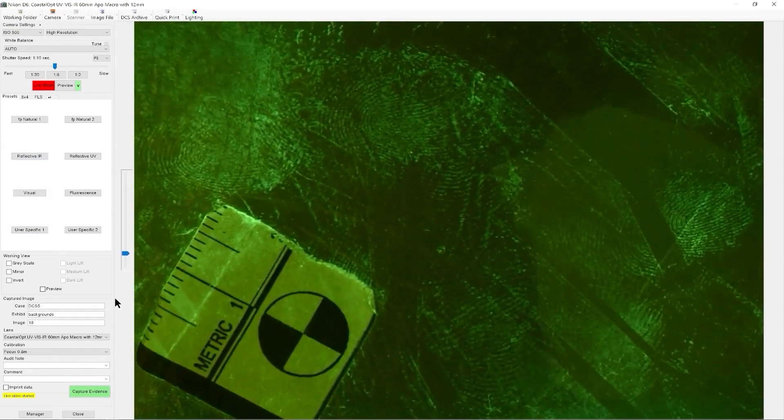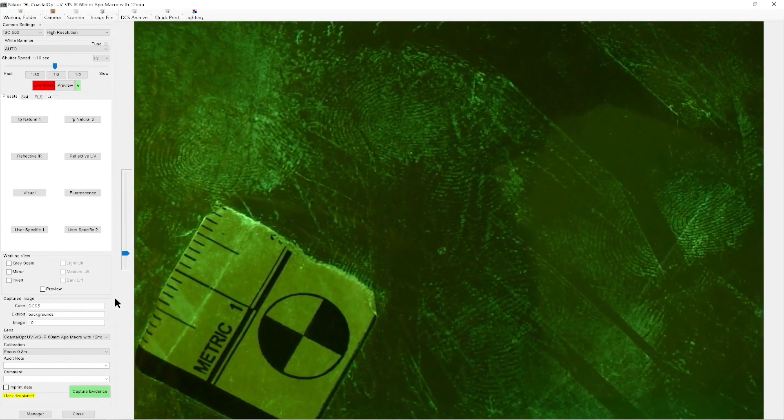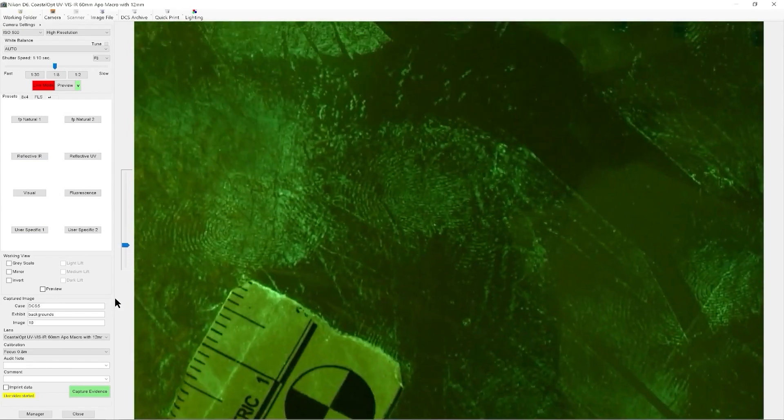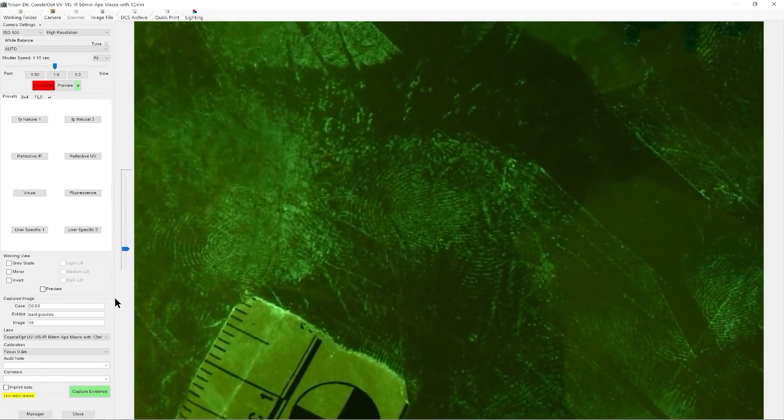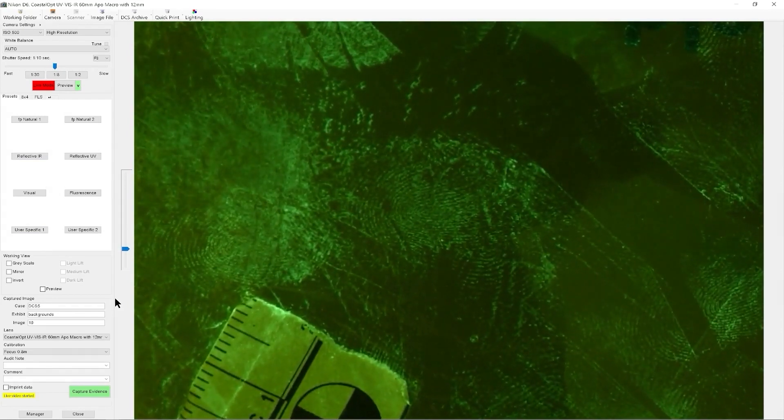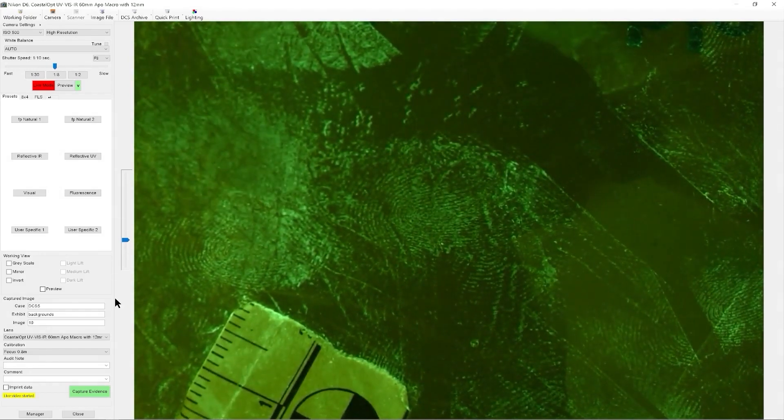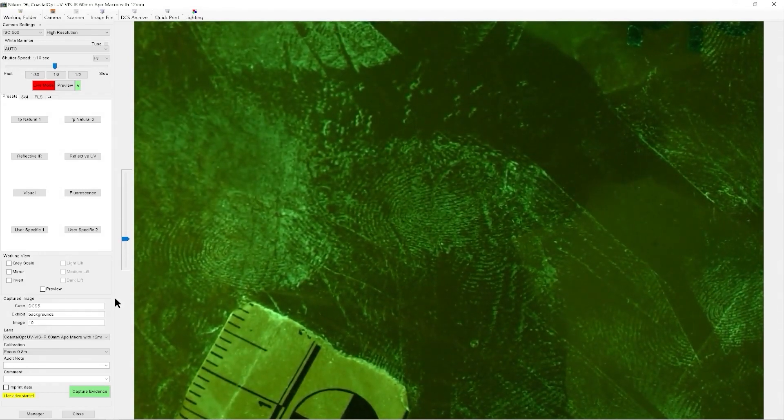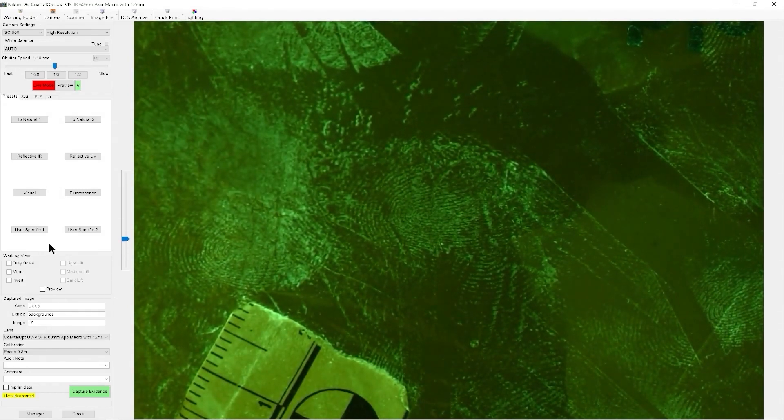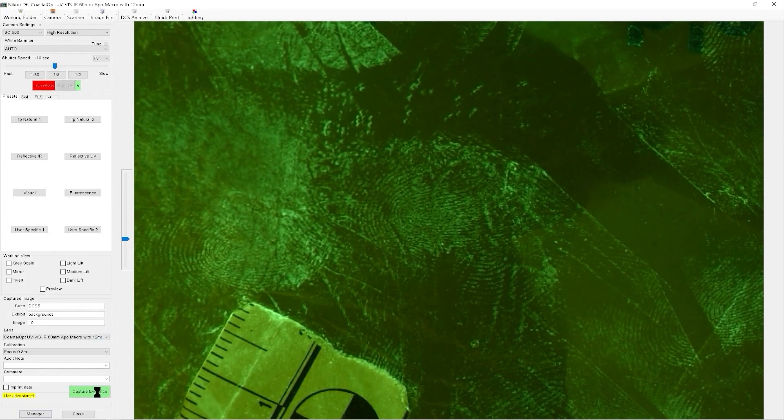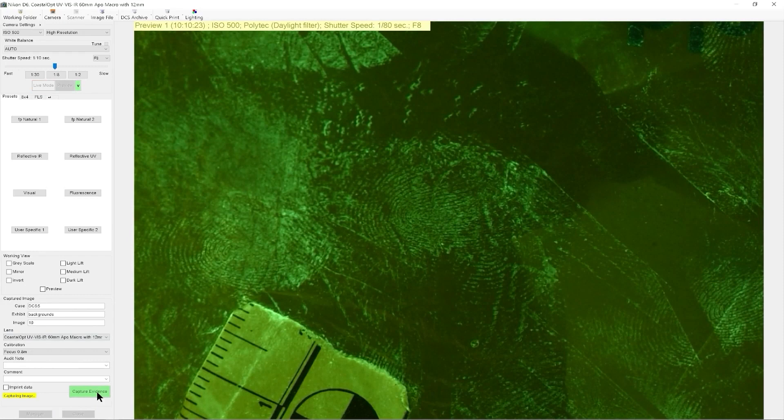So once we find the area that we're looking for, we want to flatten it to make sure it's in focus. Adjust the focus, nice even illumination for our fluorescence. We can simply capture the image.